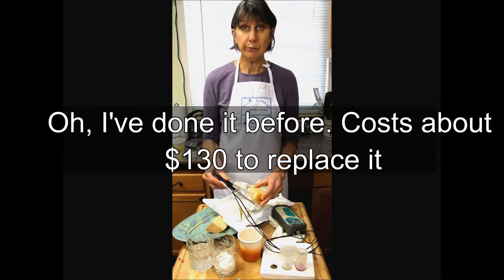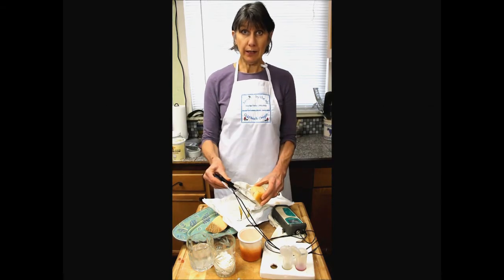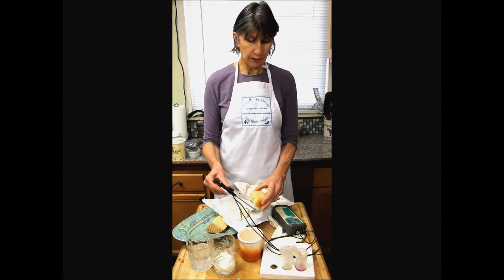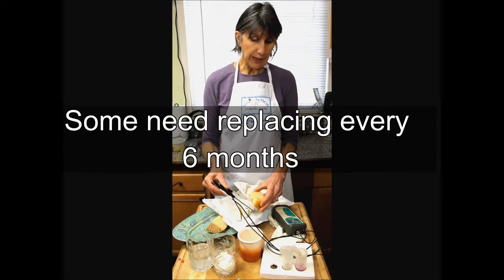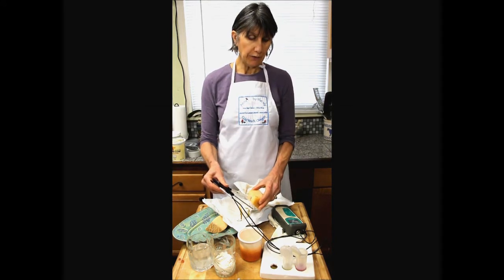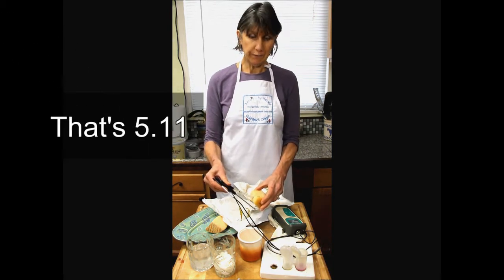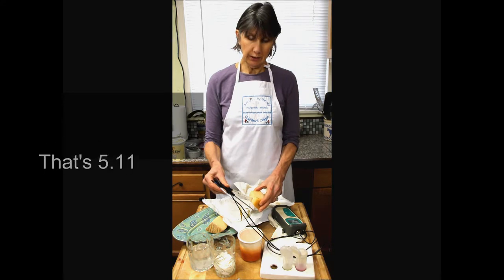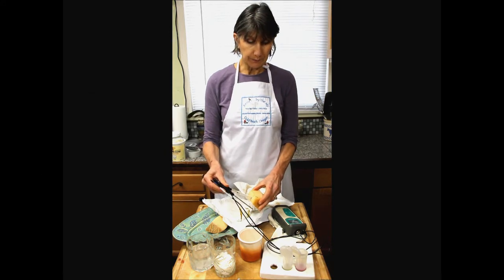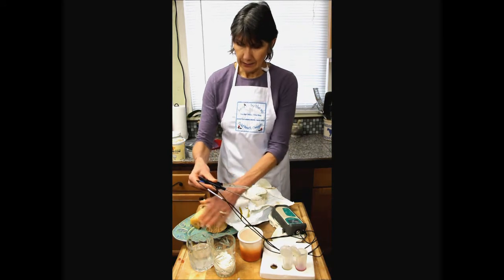The electrodes need to be replaced every few years. The better you are at caring for them, the less frequently you'll have to replace it. So this cheese, it's a little warmer than refrigeration temperature, but not by much, is 5.11. That's probably about where it was when it was finished and salted a couple months ago. They hold their pH. They don't change.